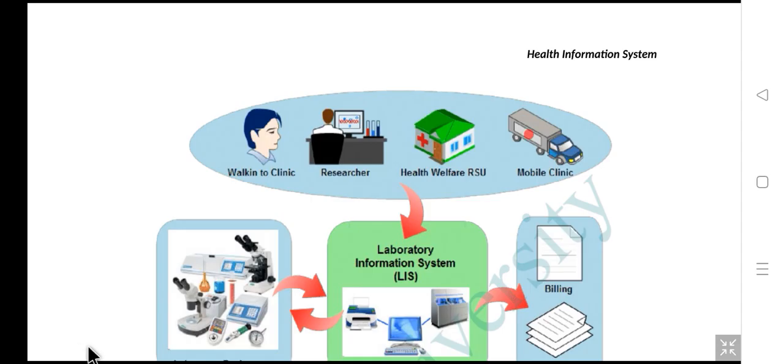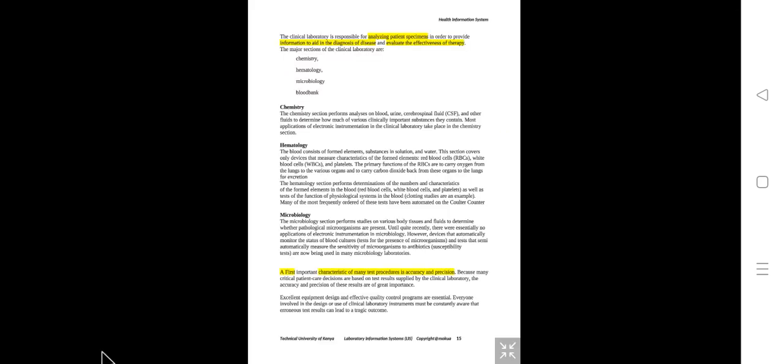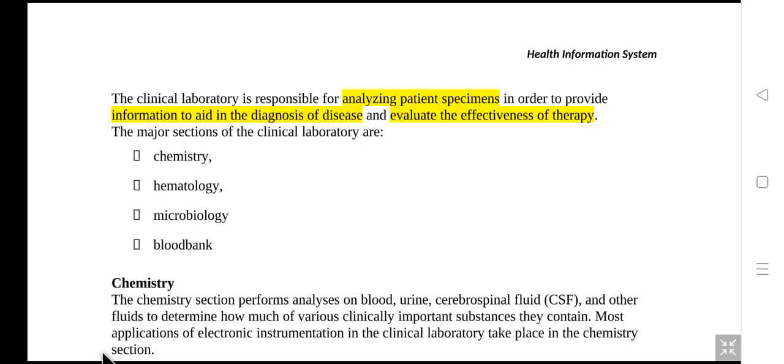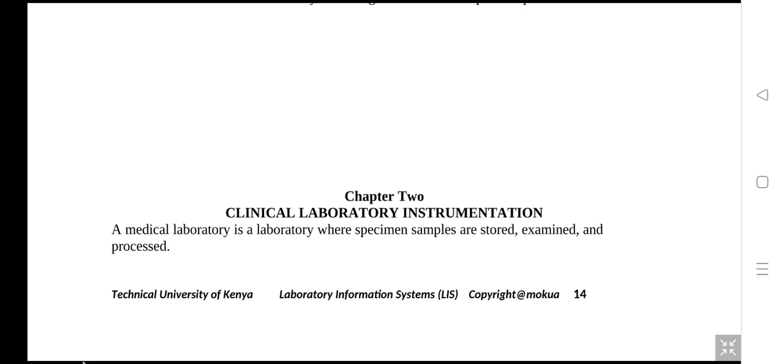which is, it's a very interesting, LIS is a very interesting unit, and we know everything is moving on, so we need to look at something very important there. We are now on clinical laboratory. We are on instrumentation.